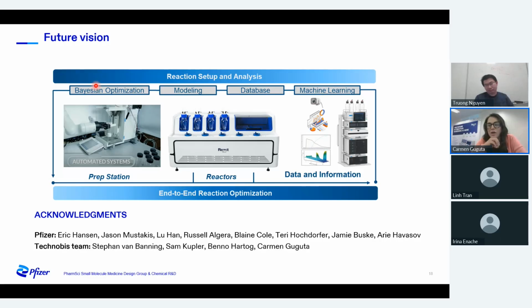So the question is about how consistent the sampling is. Usually when we test, we pick the same reaction at the same time, take 5 samples, and get the absolute area of those samples. If they are relatively similar, we consider it consistent.